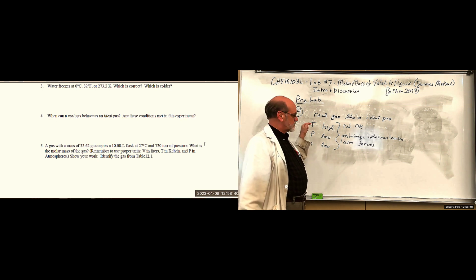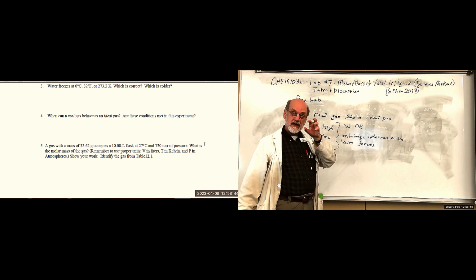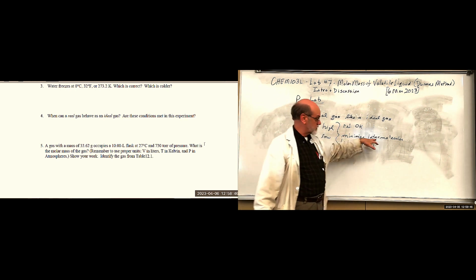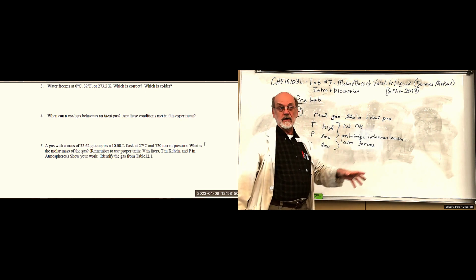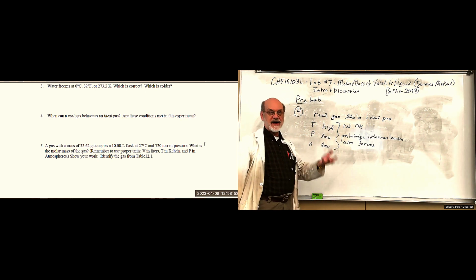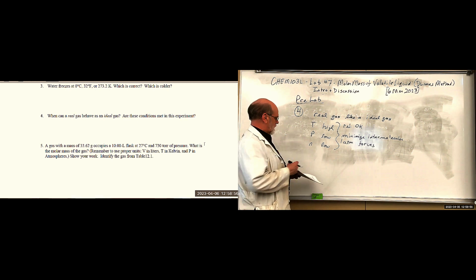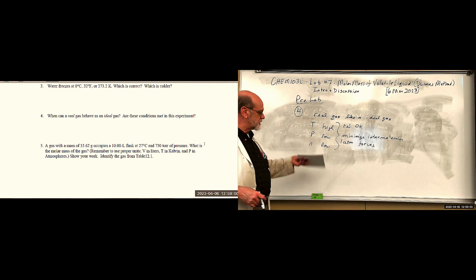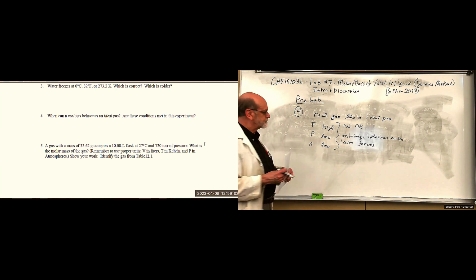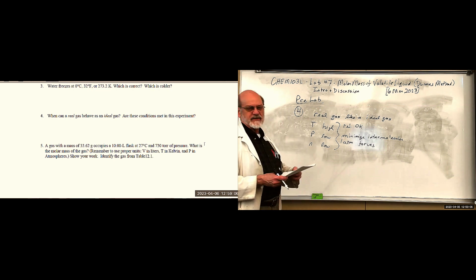But if you don't get it significantly higher than their boiling point, then you may still get some interactions that could skew your results, so we should always be mindful of that. And low moles, once you get it in the gas phase, this is guaranteed. So essentially we've met the conditions.